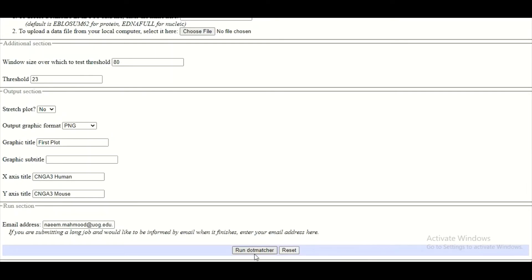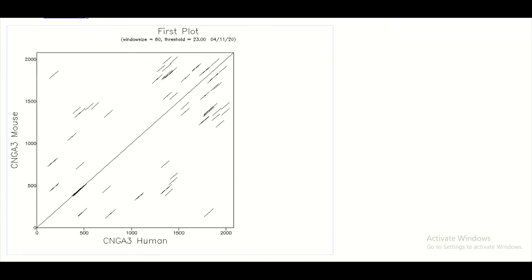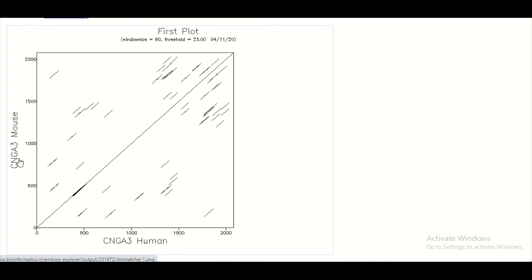So we will run this dot matcher once again, and this time the dot matcher gives a pretty nice result. There is one central diagonal line which is very obvious now, letting me know that more or less both sequences are the same. But there are local similarities as well, and these local similarities are apparent here with the small parallel diagonal lines.